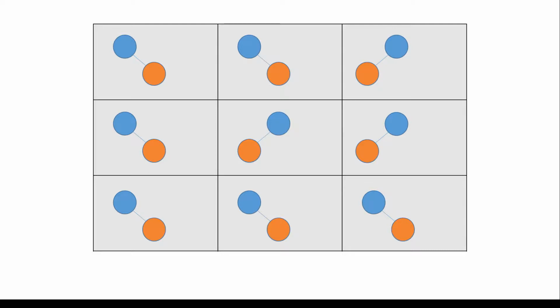Hi, so this is a short video about modelling disorder in crystals. We're going to run through an example. First, some quick definitions. Disorder occurs when unit cells in the crystal contain different contents. It might be different element types, it might just be different conformations of molecules.